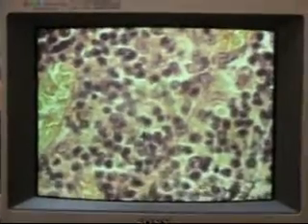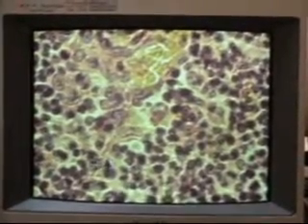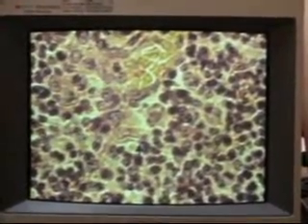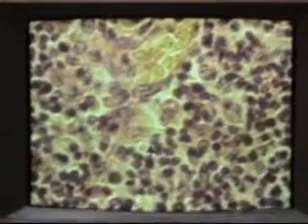It is also kind of hard to pick out the connection between the stromal cells, the epithelial reticular cells, but here maybe there is the lighter nucleus, and if you imagine that this is the process of one cell going this way, okay? And this also has a process in this direction. But you see that there are cells everywhere.